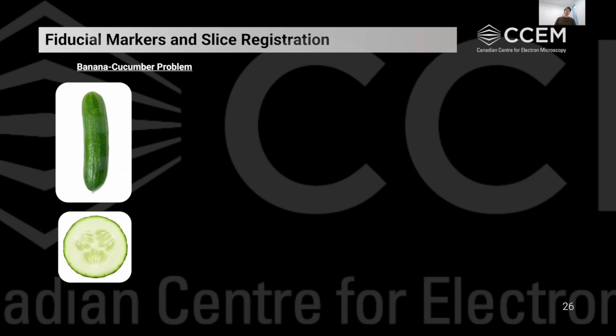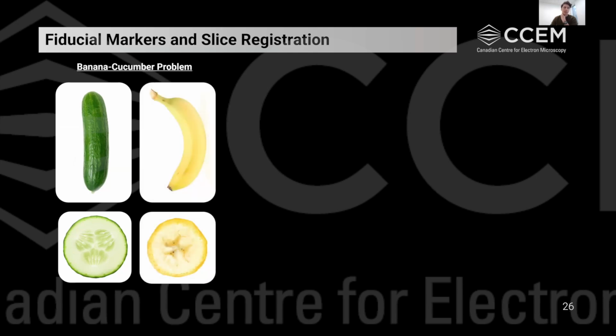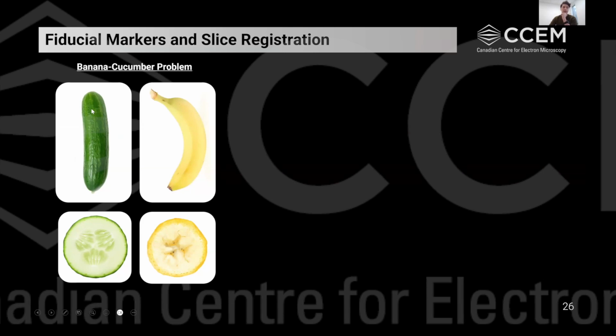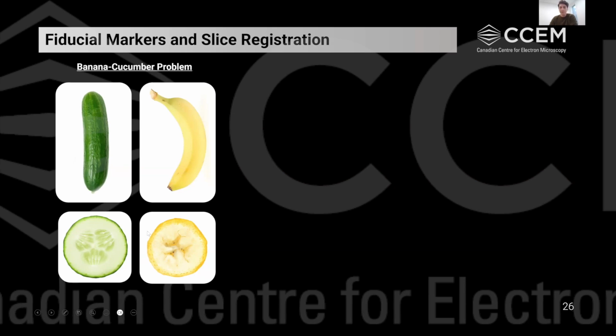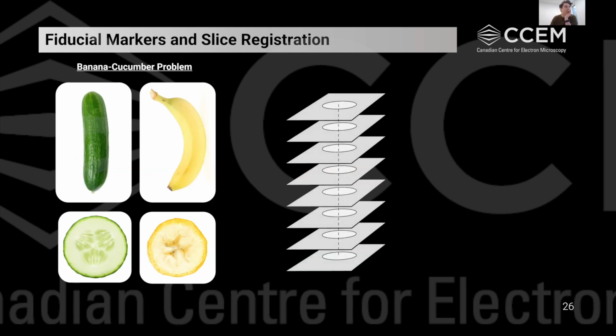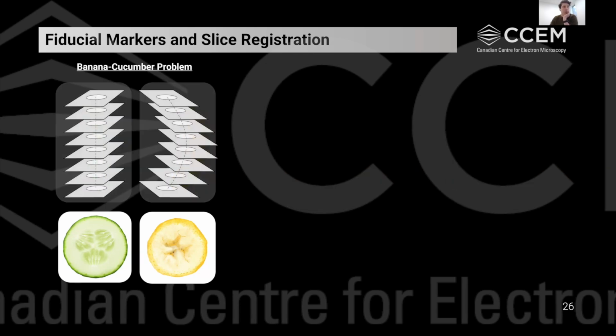And so if we've acquired our slices, I want to introduce now what's called the banana cucumber problem. If we look at these two shapes, we can see that they have very different morphologies. Our cucumber is very linear in shape, whereas that banana is very curved in shape. But if we look at a single 2D cross-section through each of these, it is circular in shape. So if we have this arrangement of circles, how do we know whether these circles are arranged in that linear form or whether they form that banana type shape? And the answer is with fiducial markers and using proper slice registration protocols.